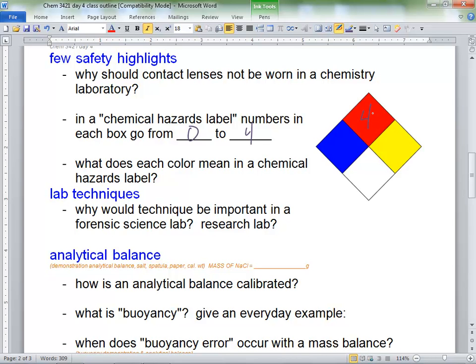Keep it nowhere near a Bunsen burner. It shouldn't even be in that room. Don't do anything volatile. It has to be stored somewhere. Not violent. And it should be stored with other compounds that are highly flammable, right? They're all stored in that metal arrestor box. Yep.